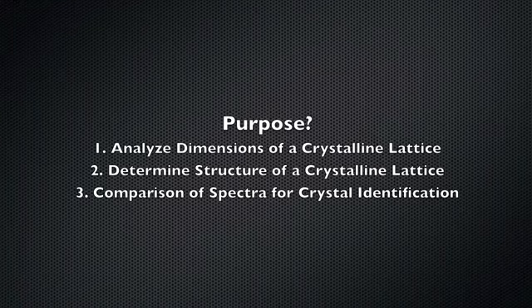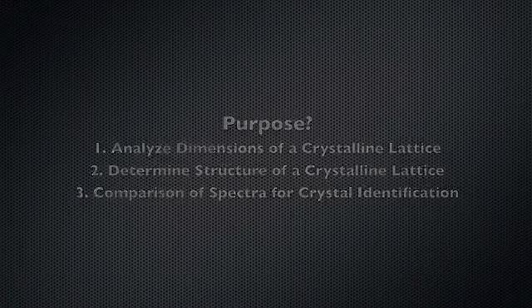Step 2 involves determining the structure of the crystalline lattice from the information that was gathered in Step 1. In the third step, comparison of spectra is used for crystal identification. Previously stored crystal spectra are used to indicate if the crystal is a new discovery or is already banked in the library.